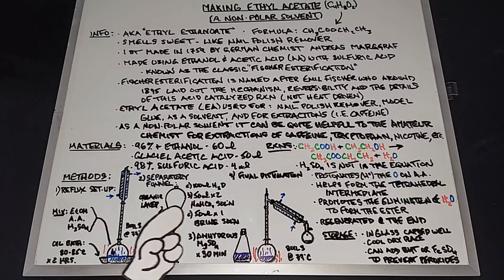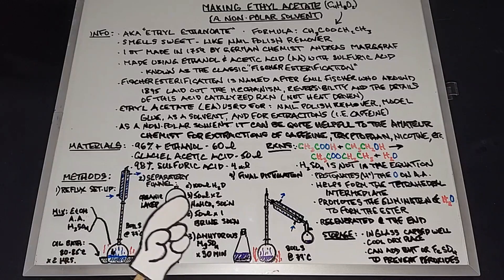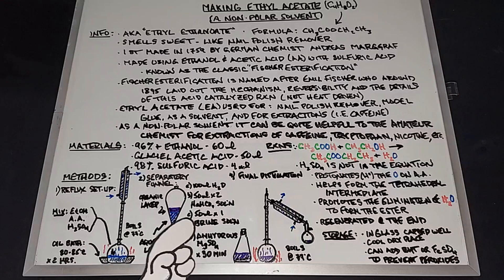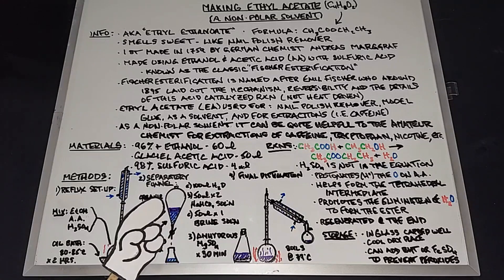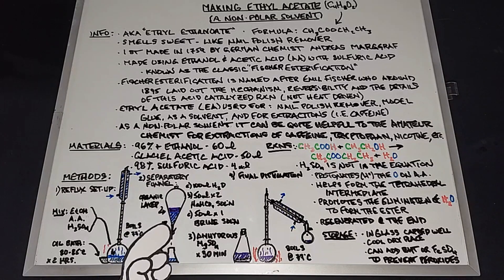Once you're done doing that twice, then we're going to put in 50 milliliters of a brine solution. That's a saturated salt solution, which will help draw even more water out of this organic layer, which is the ethyl acetate. Once we're done, we'll drain that out.